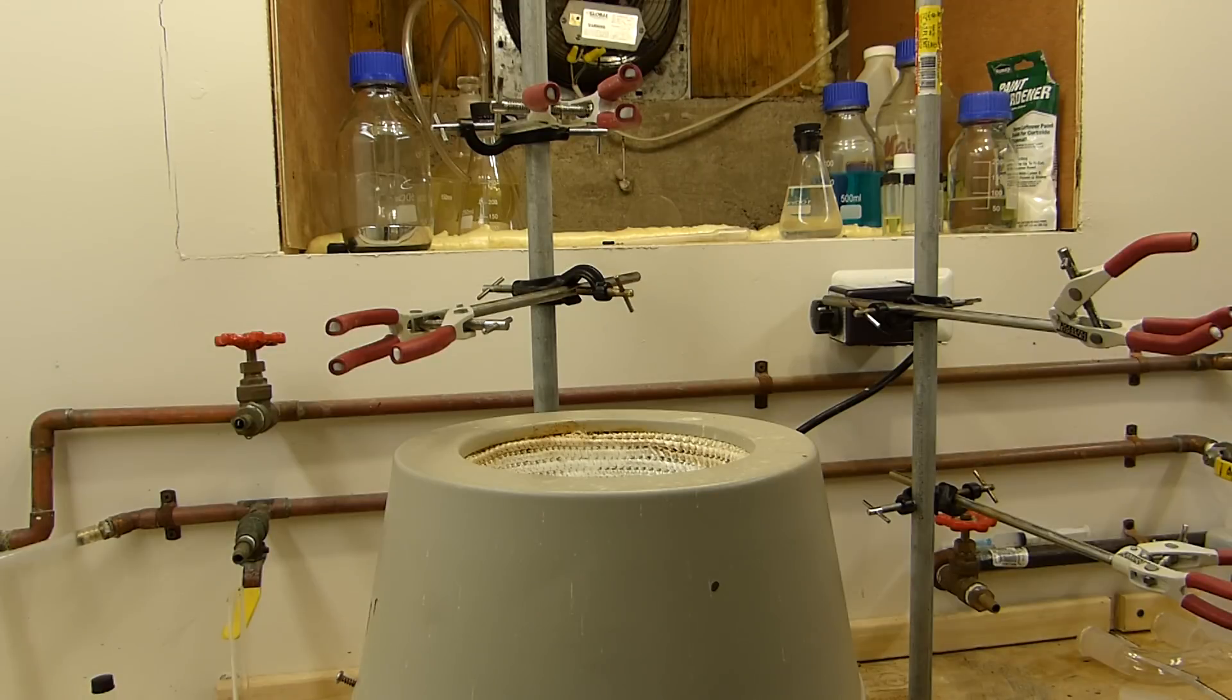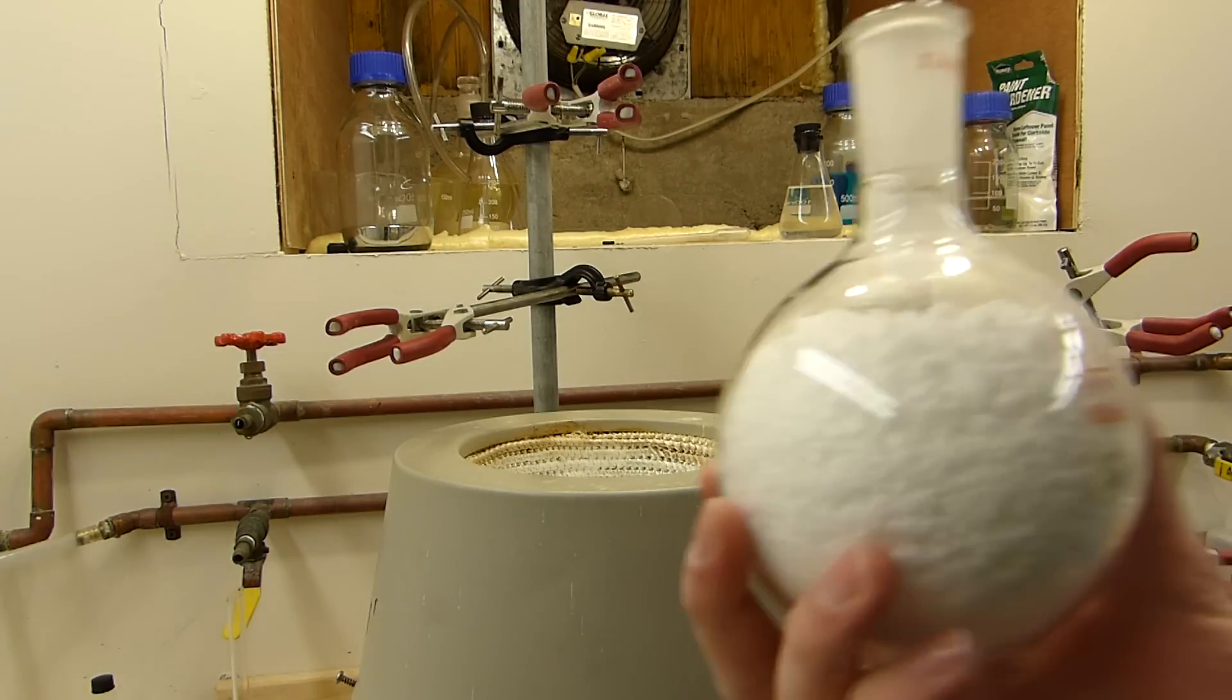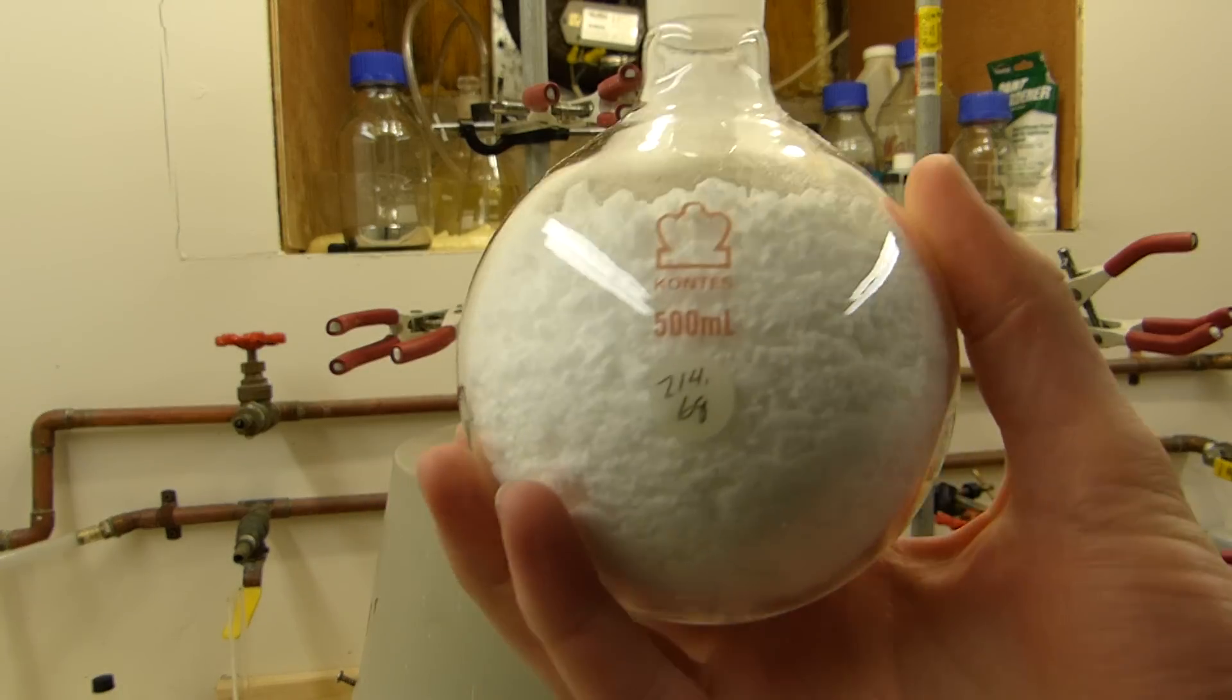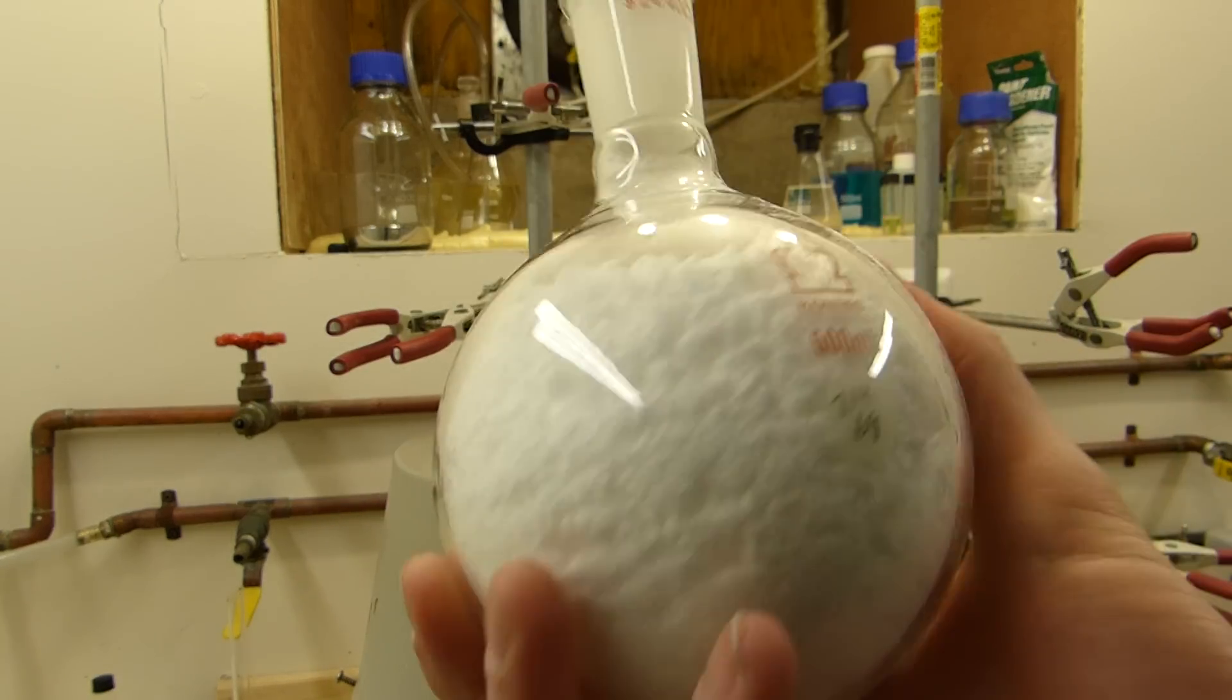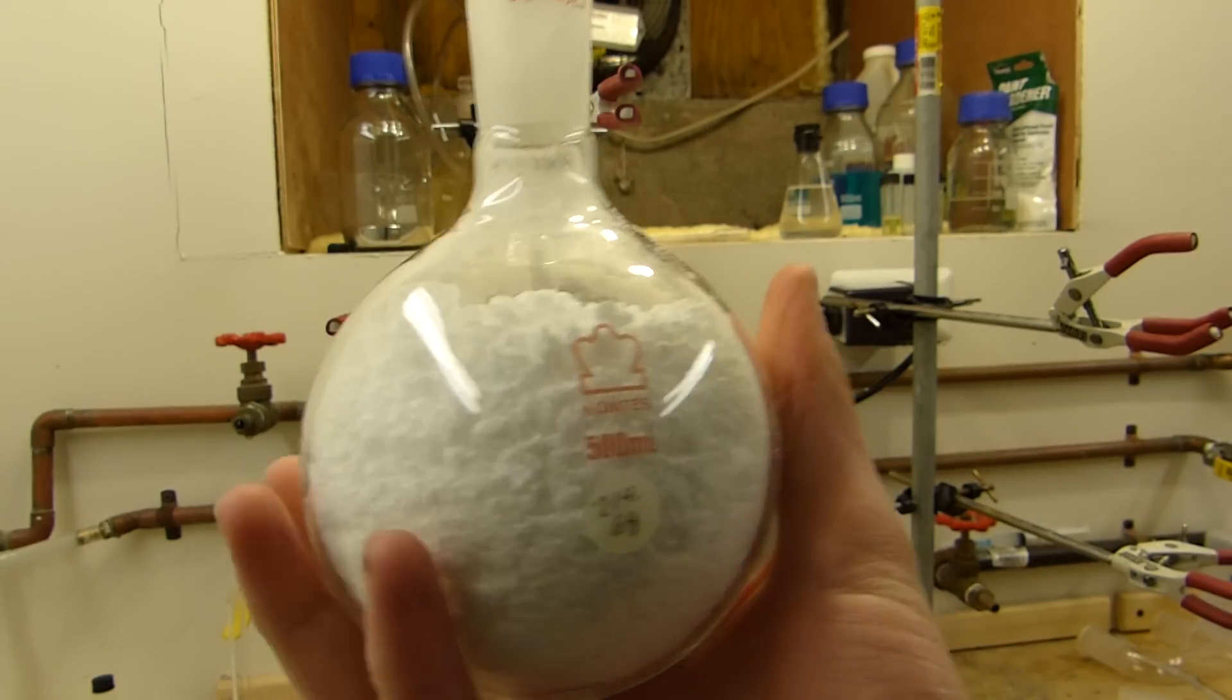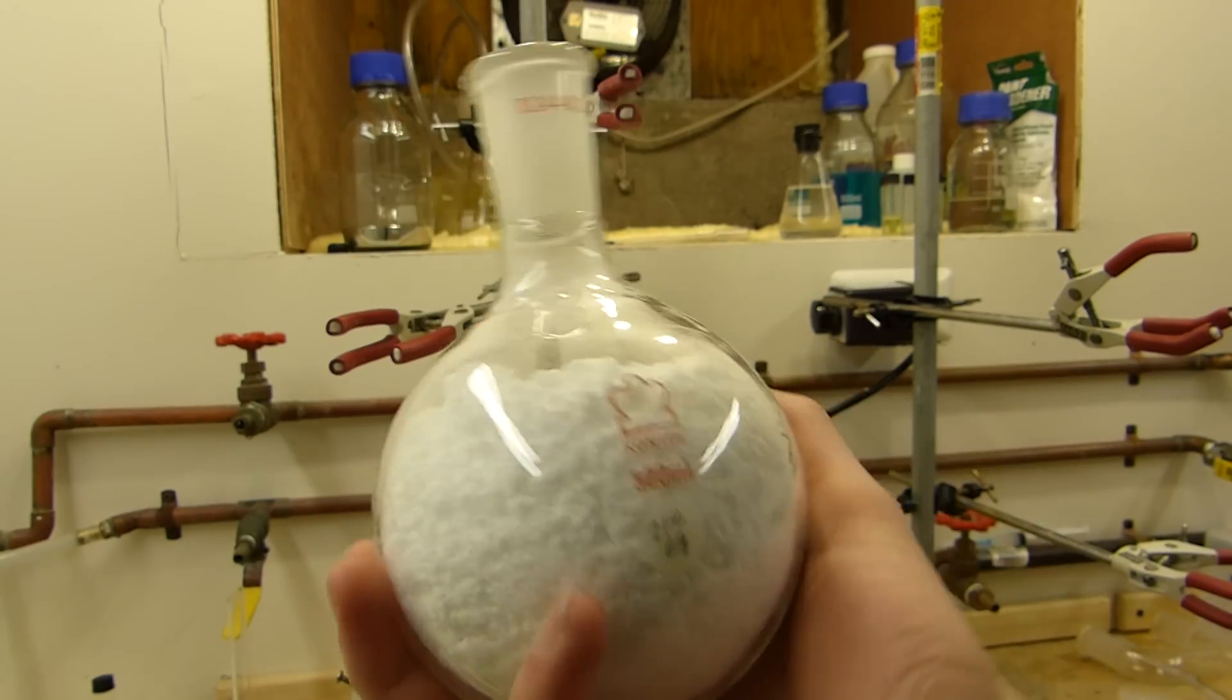I'm running this on a 2 molar scale, so I need to place 164 grams of anhydrous sodium acetate into a round bottom flask. This flask here looks very, very full, and that's just because the sodium acetate is very fluffy. Once the sulfuric acid is added, this packs down to a little over halfway, which is about a safe point for a 500 milliliter round bottom flask, or any round bottom flask for that matter.